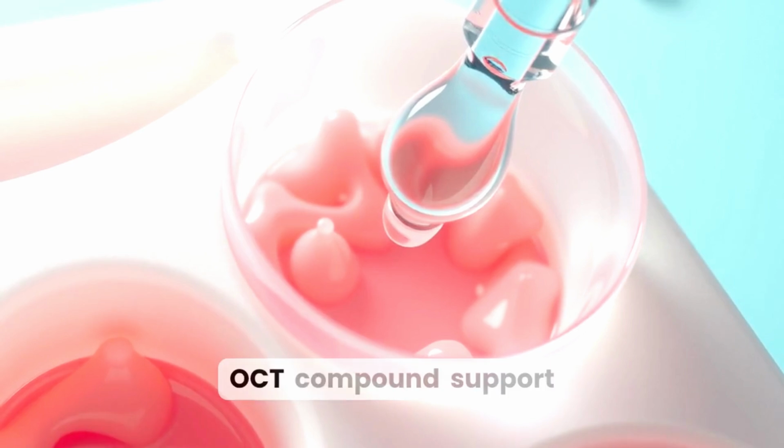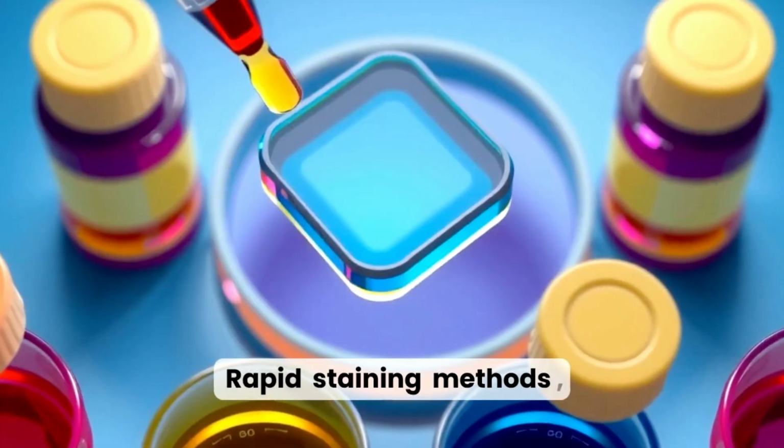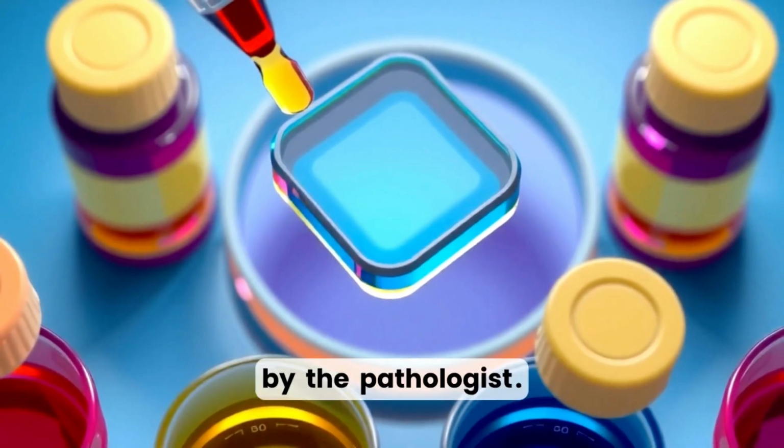Embedding media such as OCT compounds support the tissue during freezing and sectioning and improve cutting quality. Rapid staining methods, commonly quick hematoxylin and eosin, provide sufficient contrast for immediate interpretation by the pathologist.